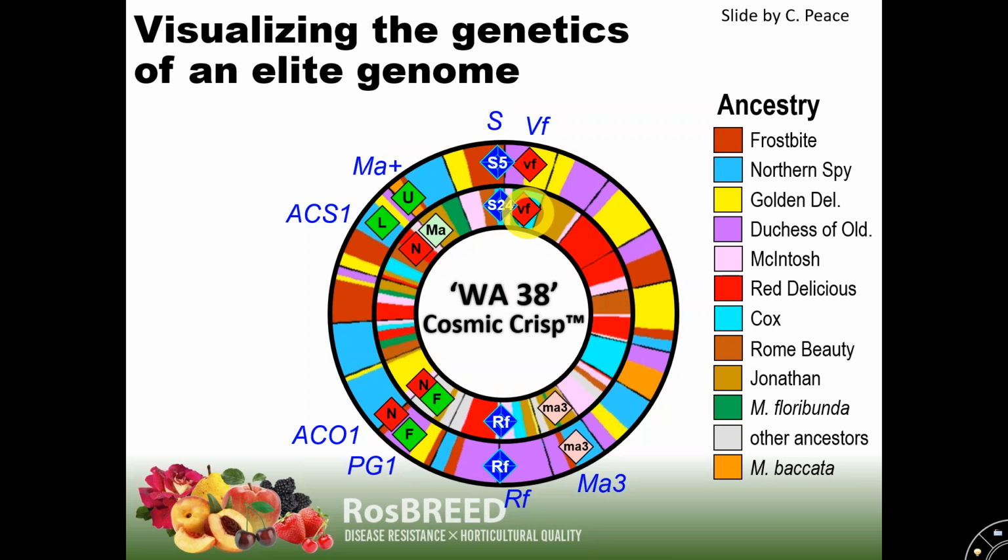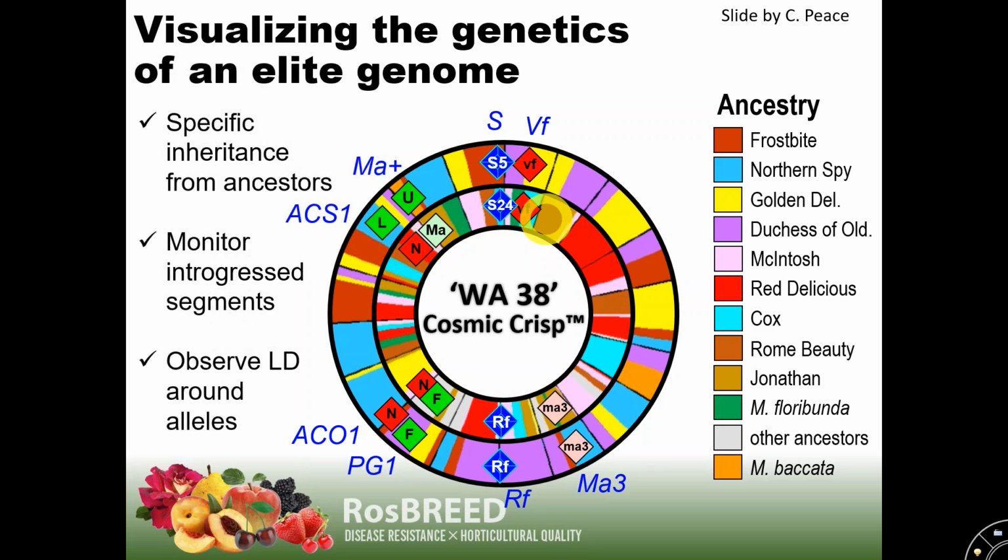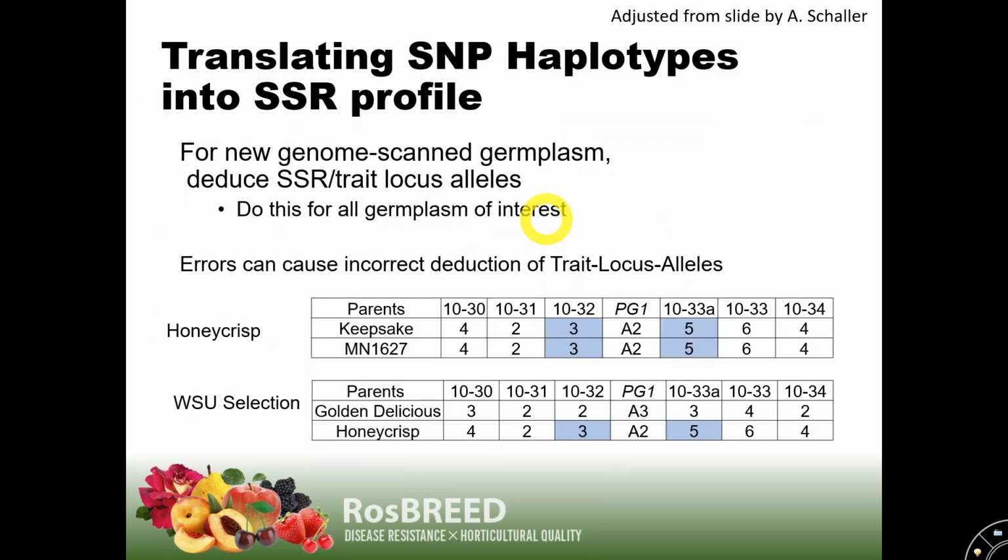I believe also in most of these cases, segments are only shown when the segment is large enough. So once you get errors in that, those segments might be broken up into smaller pieces, and they might not even show anymore.